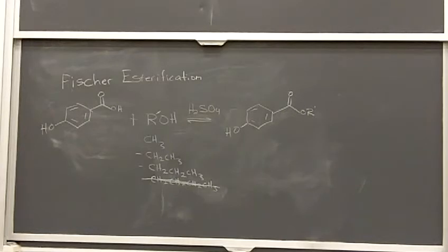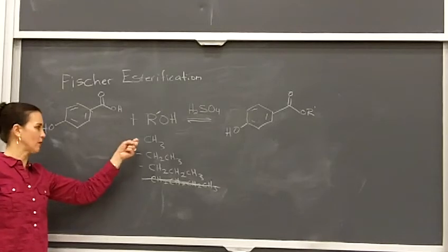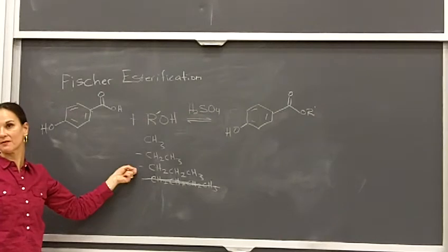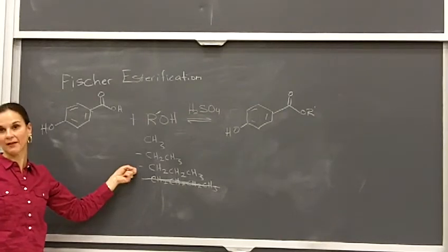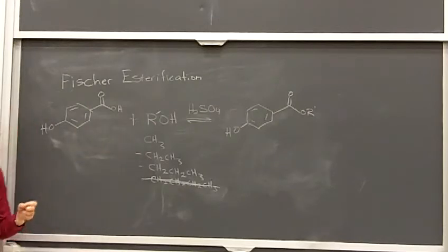As it is, we're going to let these reactions go for 2 hours at reflux. So that's pretty much the maximum amount of reaction time we can have in lab, especially at reflux, because you've got to get it up, heat it up, and all, then still have time to work up the reaction. So people who use methanol will probably get better reaction conversion with methanol than they will with propanol, just because we don't give it as much time to react, whereas the methanol is going to react quicker, okay?